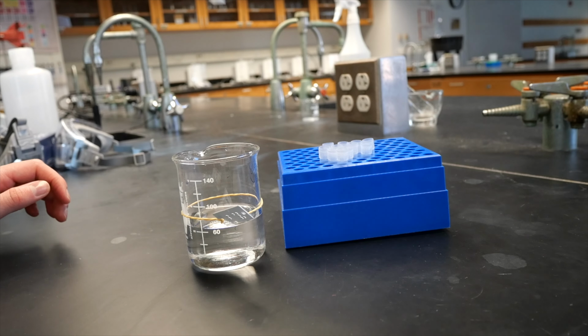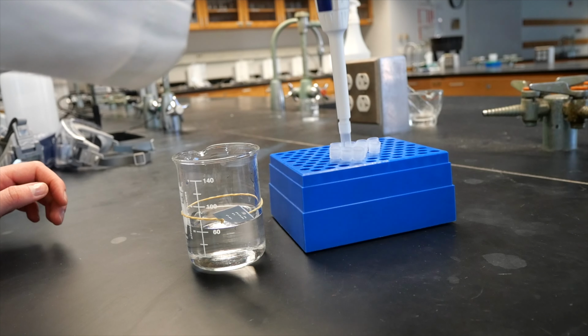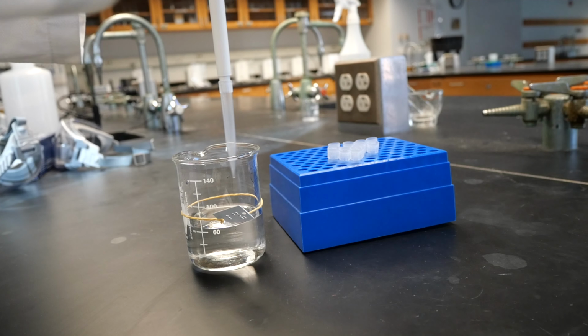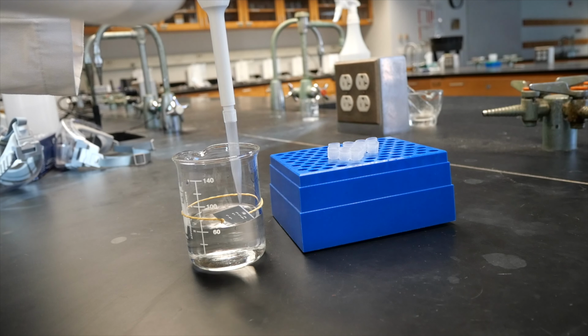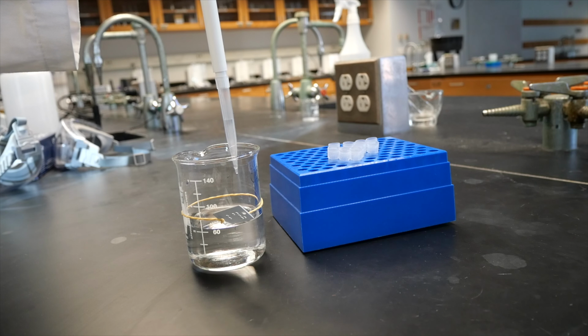To get liquid into the pipette, it's a similar system to the fixed volume micropipette, where you push all of the air out by depressing the plunger, then releasing it. But then, to release the liquid from your tip, you do need to push down the plunger once till you feel a small, soft stop, and then push again to push all the liquid out. It's a 2-stop plunger compared to just one stop.